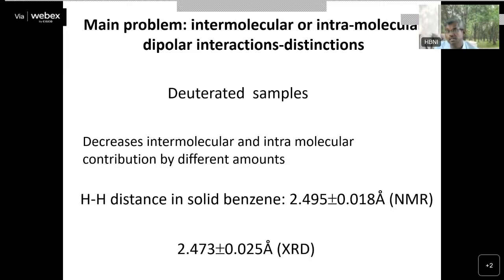So as I mentioned, dipole-dipole interaction gives good information, provided the system is simple. If you have a powder sample with multiple nuclei, it is very difficult. For example, in some of the aluminosilicates, we have 21 different types of silicon. So 21 different types of silicon will have 21 different types of dipole-dipole interactions, and all of them will give a very, very broad pattern. And from this broad pattern, it is very difficult to get any information by recording NMR.